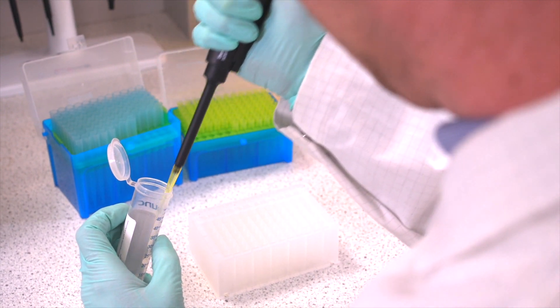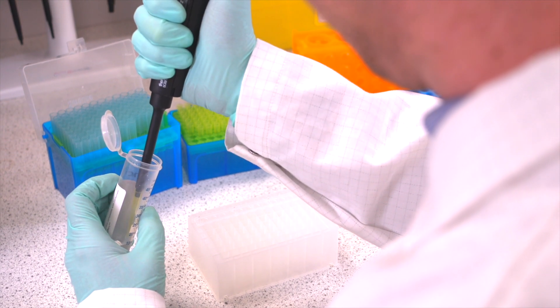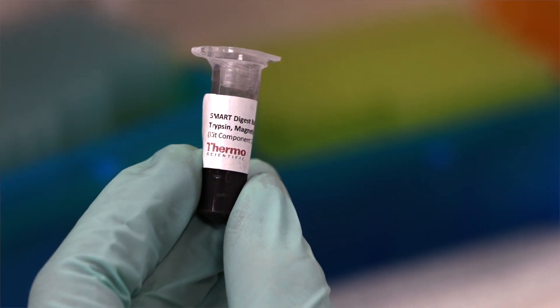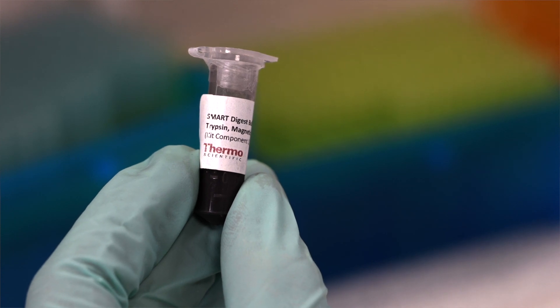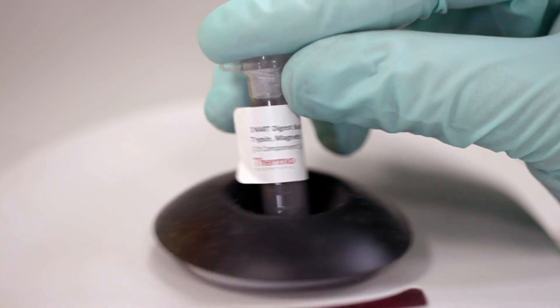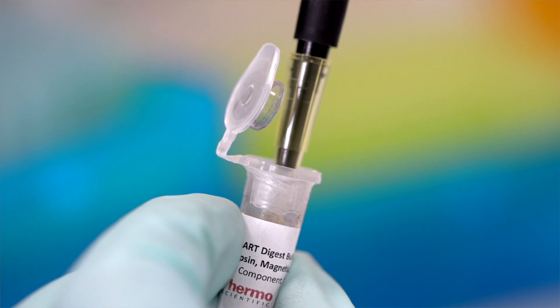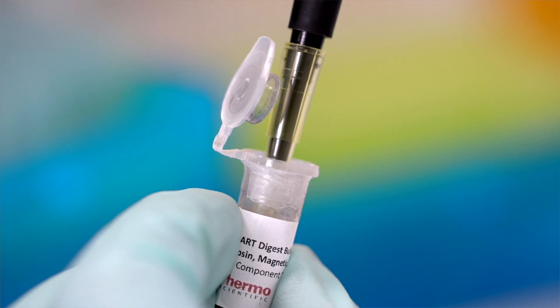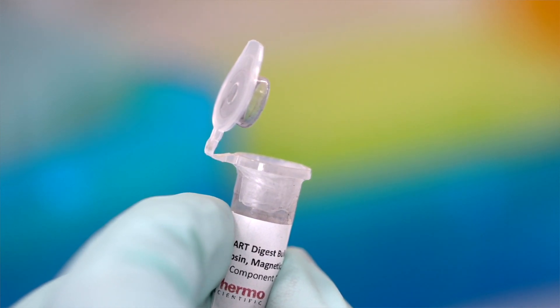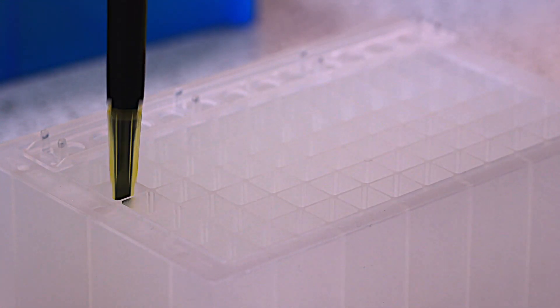Next, add 100 microlitres of neat Smart Digest buffer to row D — this will be the resin lane. As part of the Smart Digest kit, pre-made bulk magnetic beads with immobilised trypsin are provided. The only preparation required is to defrost and vortex before pipetting. Add 50 microlitres of the bulk magnetic beads to the same row D.